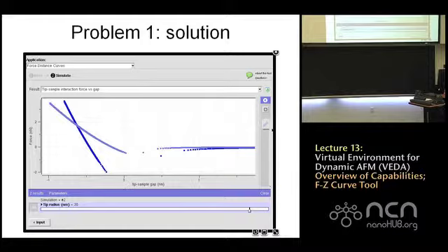Oh, yeah. Okay. So one thing I wanted to do was to change the input to specify the intermolecular gap. The default input was adhesion force, and specifying that is basically to say when the tip gets bigger, the adhesion force goes up because the van der Waals forces are acting on more. So the intermolecular gap is almost more of a material property than the adhesion force. So basically you've forced the adhesion force to be the same thing in both cases. Then I have to run the simulation again. Yeah.